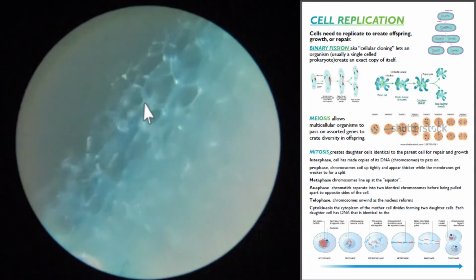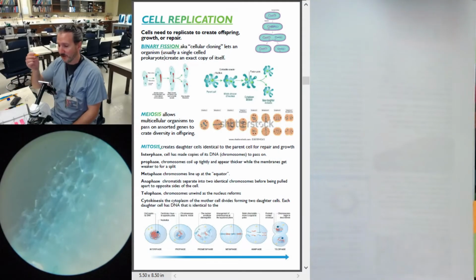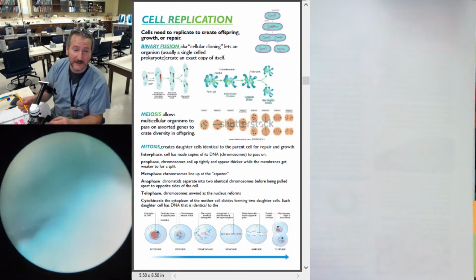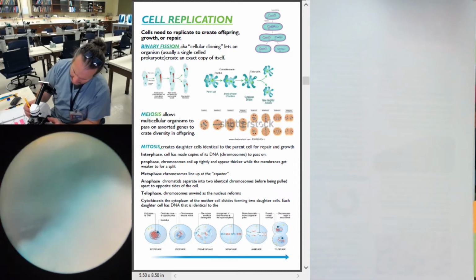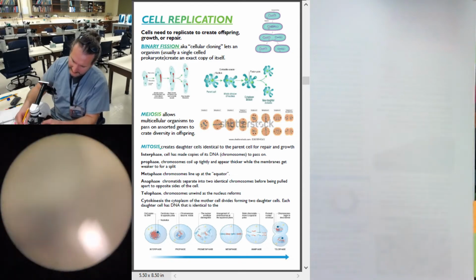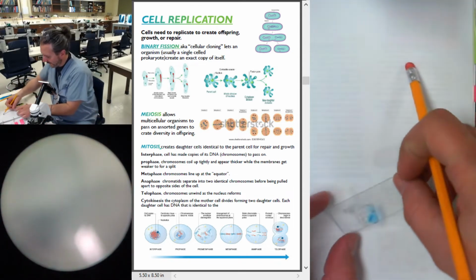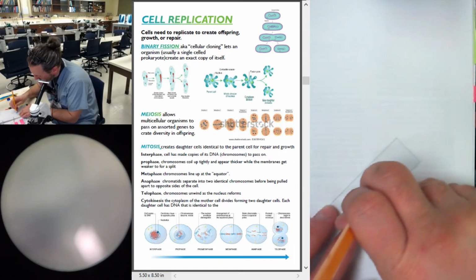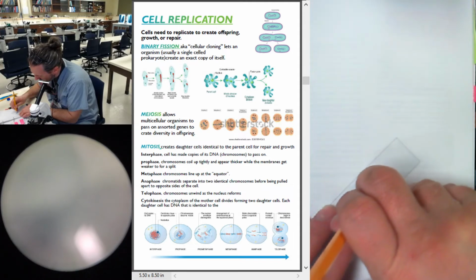So, one more thing I'm going to do. I'm going to take my pencil, just like this with the eraser. Turn this back to scanning. Need to focus it, but I'm going to go right on top of that piece of onion. It's been soaking a little while, and I'm going to kind of smush it a little bit. It's not smushing too easily, so I'll pull it out and get a nice clean smush. You can see my dyes, flat down on it, smush, smush.